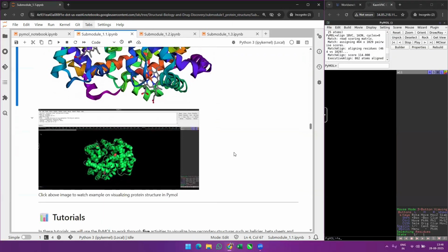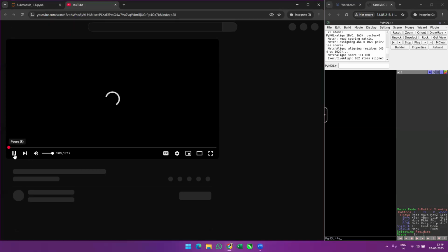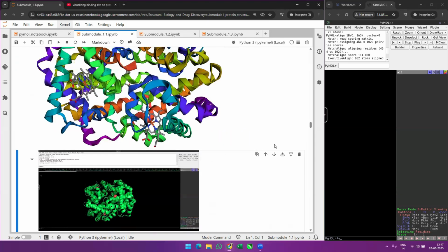So that was how you can easily visualize the different levels of the protein structure. You also have here a tutorial recorded by Dr. Sitharama Joy. So if you click on it, you can go through this tutorial to go through the different protein structure visualizations in PyMOL. So until here, you learned how to fetch a real sequence, that's a primary structure. Then you visualize the helices, sheets, and turns, that's secondary. And then we discussed tertiary stabilizing forces and explored a quaternary complex with a cofactor.